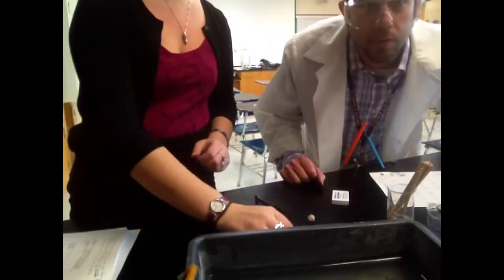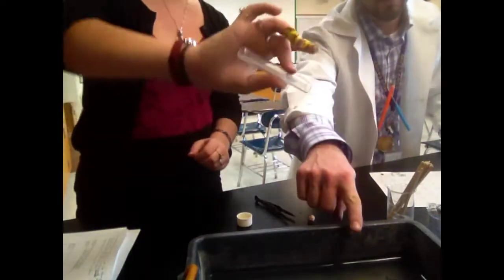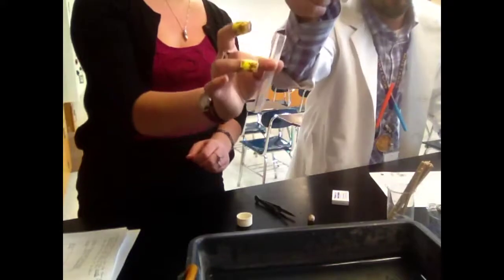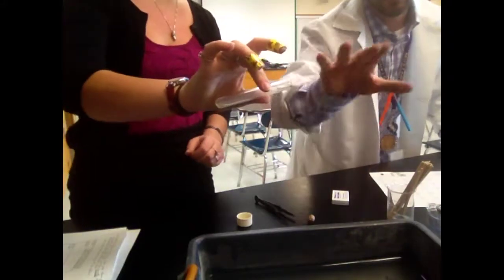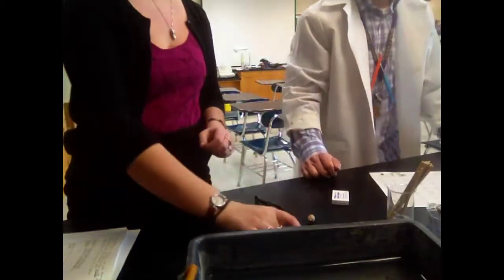Notice Ms. Bardoyan's holding it horizontally because we're not sure if the acetylene gas is more dense and going to drop down or less dense and going to go up. So she held it nice and horizontal, and that's when we ran the test. All right. Awesome. We're going to high five on screen. Oh, yeah, that's good. All right, so fill out your data table and complete the lab analysis.